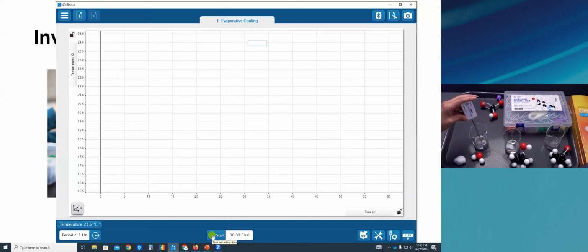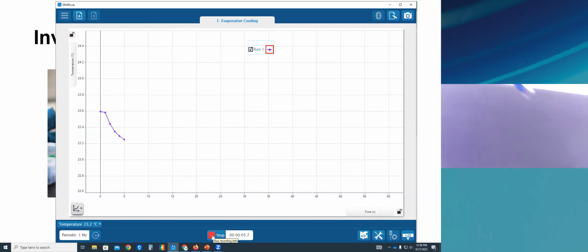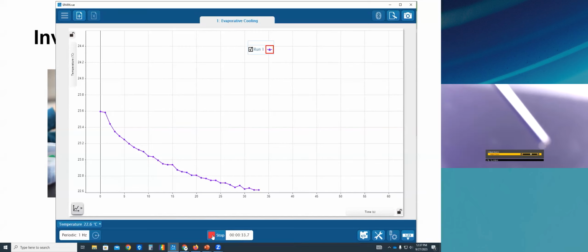So let's start and then remove it so we get the background temperature. And I'm going to switch cameras so you can see, hopefully, there we go, that there's a little drop of water stuck to the bottom of that temperature sensor. And you can barely see it on the edge there. It's the shiny part. And in fact, before I even switched the camera, an extra drop fell, but there is a drop that remains. Let me see if I can get any closer and try and resume it. That didn't help.